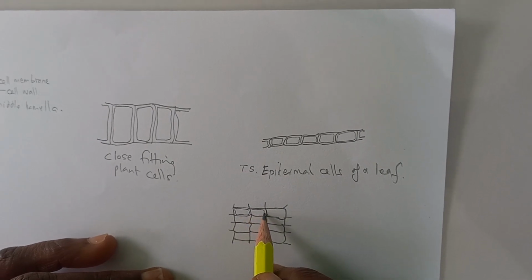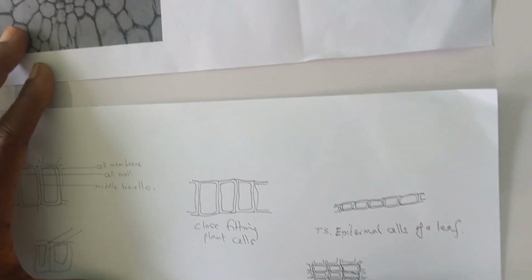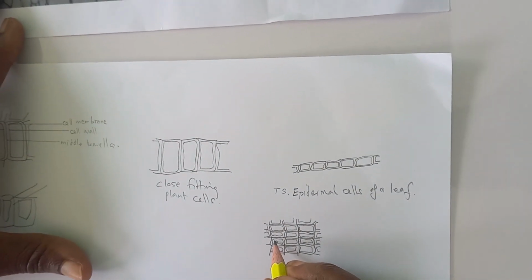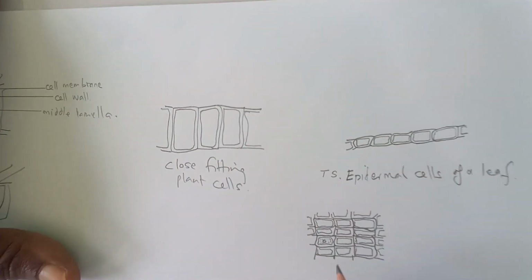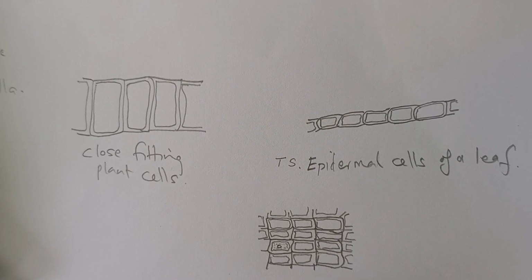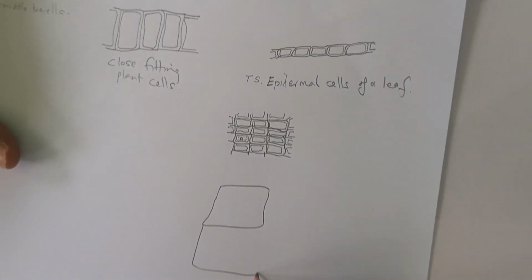I can see something like a nucleus in there. So I put it in, and the cytoplasm area, if it can be seen. So let me enlarge the cell.